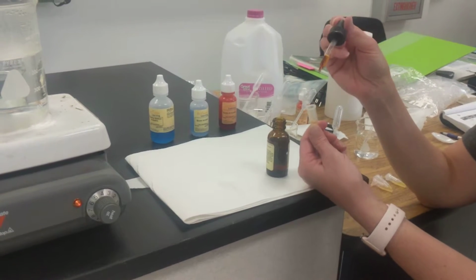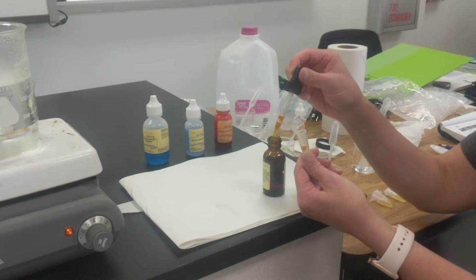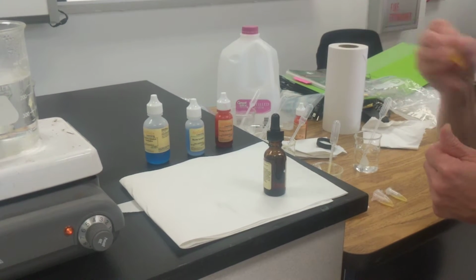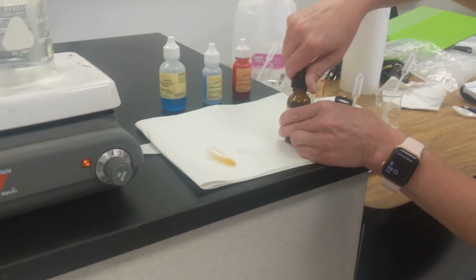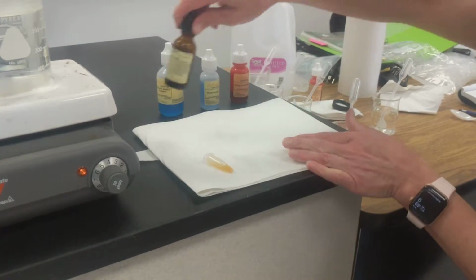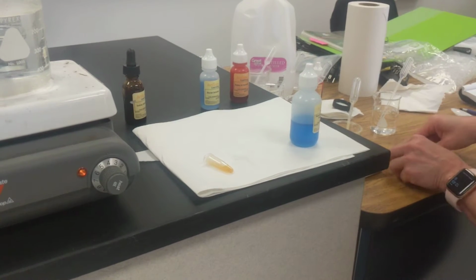All right, so iodine, we're working with our starch test. We're going to drop that in there, see if it changes. Still looks pretty gold to me. So no starch.